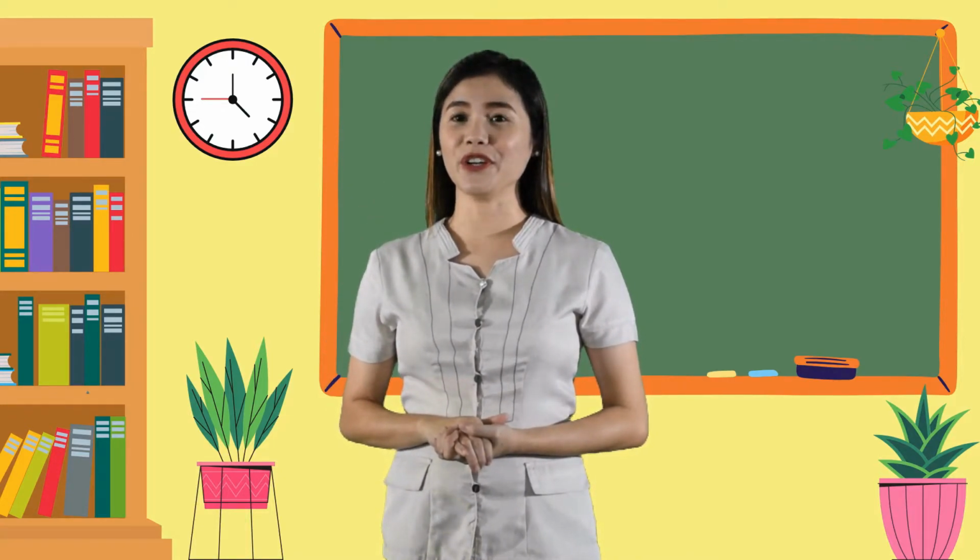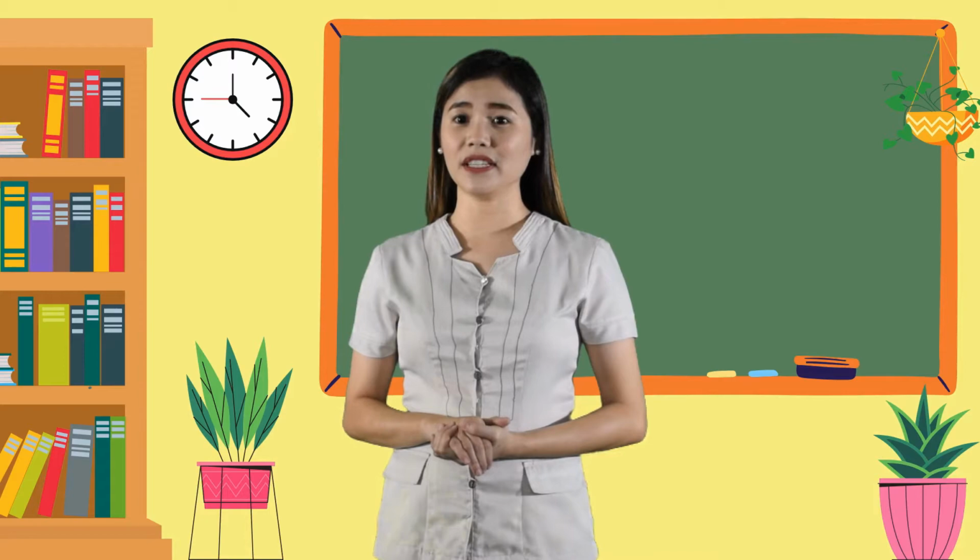Now, let's start your learning journey. Although you may not be able to get hold of the actual microscope, the learning task will provide you an exciting opportunity to explore the basic mechanism of a microscope. When carrying out activity using a microscope in the laboratory, there are necessary reminders that you have to observe and follow carefully. These include the following.